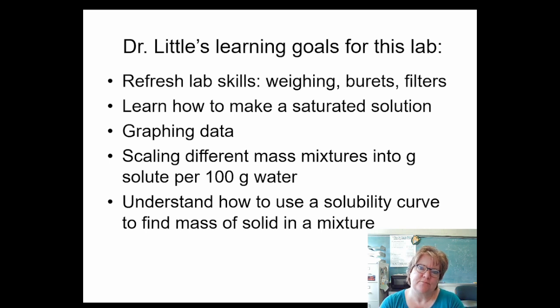How to graph data. And this is going to be a little bit tricky to get our graphs the way we want them to. Scaling, lots and lots of proportional scaling. Our standard is based off of having 100 grams of water, but reality is we often don't use 100 grams of water. We use less or more water, and I need to be able to scale, okay, what would the amount of solute be if it was 100 grams of water? And we're going to be scaling back and forth and back and forth.